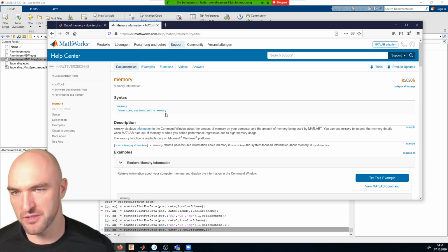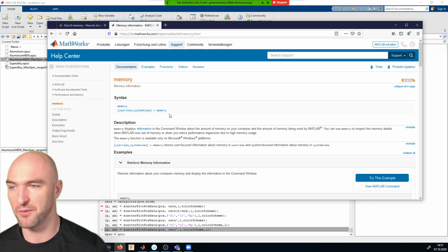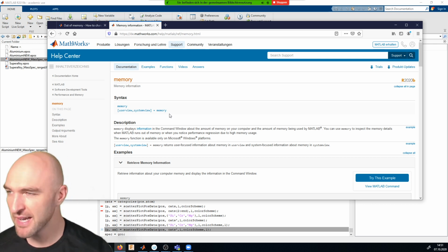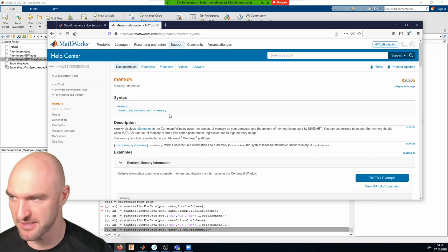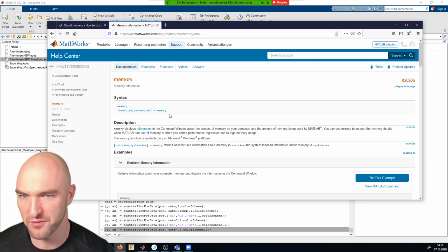How large would you suggest? It depends on how large your datasets are. If your datasets are all just 1 million atoms or 5 million atoms, you probably can get away very easily with a 4 gigabyte RAM machine. Unfortunately, I don't know how much bigger MATLAB itself has gotten. But back in the day, I had a laptop with 4 gigabytes of RAM and it worked fine on most things.